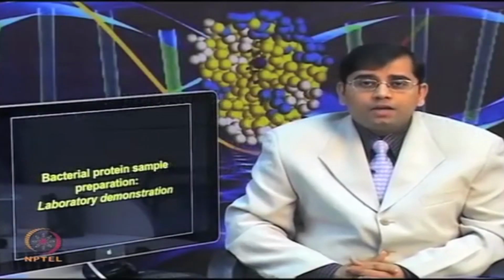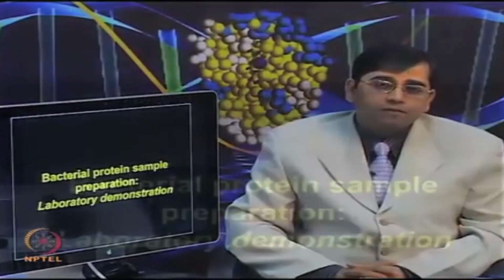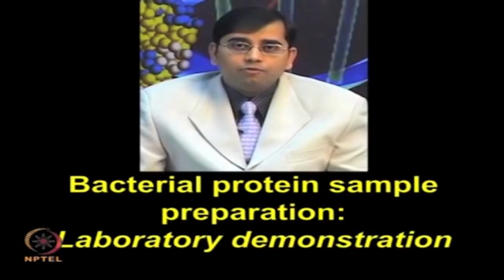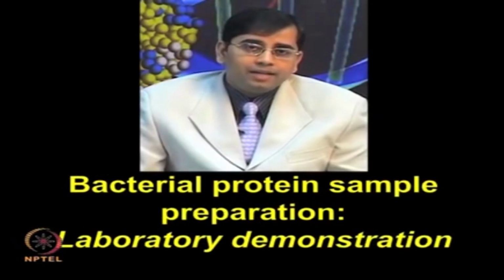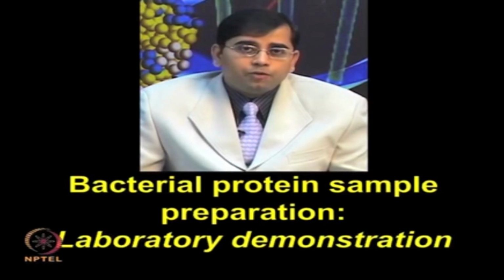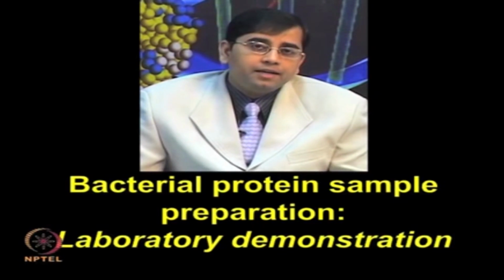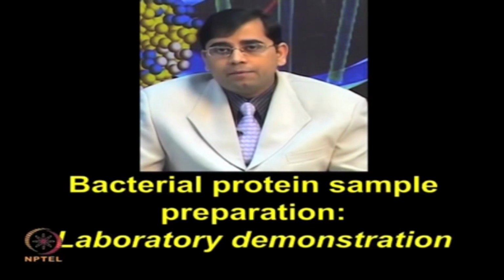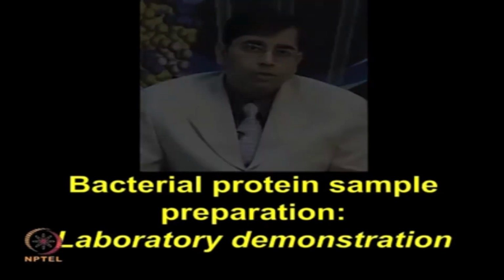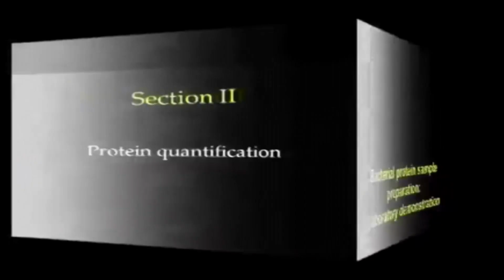Okay, so I hope this video was informative and now you are able to appreciate the complexity involved in this procedure, as well as how useful this method can be for different types of biomolecule extraction including DNA and RNA, and how protein can be freed of various types of contaminants by using the TRIzol method.